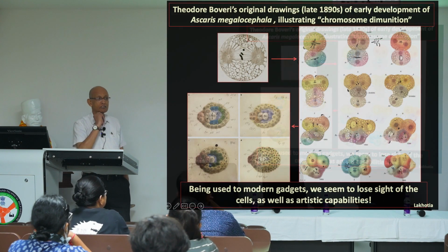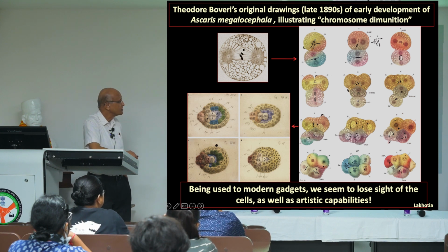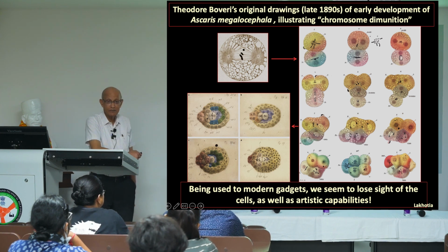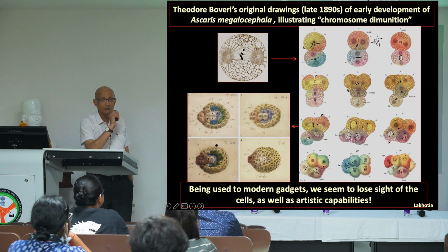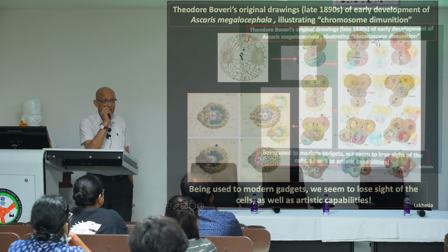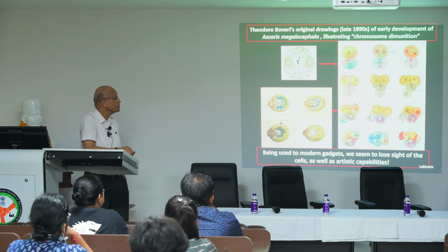Having talked about these advanced microscopy, I always like showing these nearly 120-year-old pictures, hand-drawn, beautifully colored, and the detail that they show, I don't think our current microscope will show it. What your eyes can see in a microscope, by changing the focus and changing the contrast and so on and so forth, the optical system, no matter how good they are, will not show you all the details.